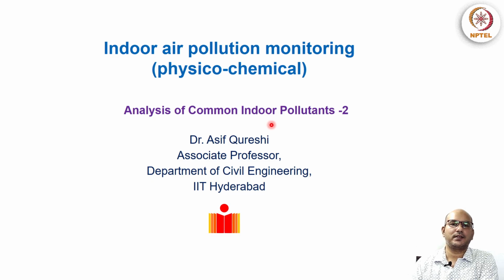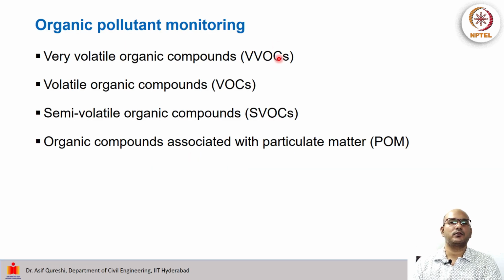Hello all. In this lecture we will continue our analysis of the common indoor air pollutants. We will look at some pollutant-specific methods and some detection methods or detection instruments. First we will go to the organic pollutants. These organic compounds could be very volatile, or semi-volatile organic compounds, and compounds that are associated with particulate matter, particulate organic matter, let us say.